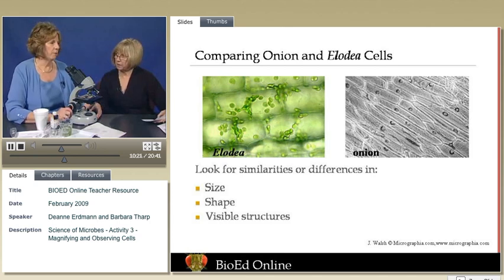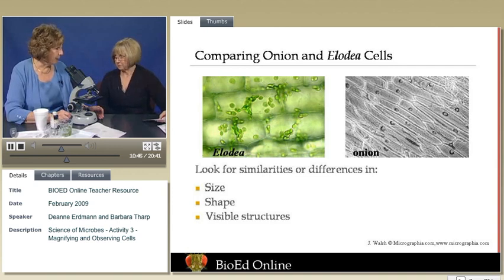You know, over the years of teaching, and I taught biology for a long time, I've had more drawings of water bubbles, the edges of cover slips, of everything imaginable other than what they were supposed to be looking at. And for some reason, when students start looking under the microscope, the first thing they get in focus, they just assume that that's what it is. And what that really points to is how little experience they have, and how little conceptual understanding they have of what the microscopic thing that they're looking at really is.